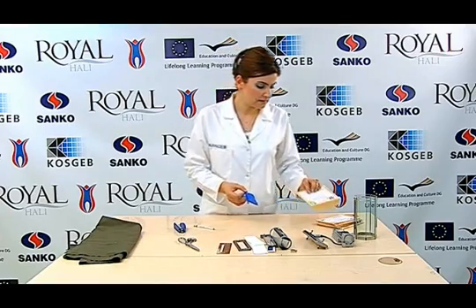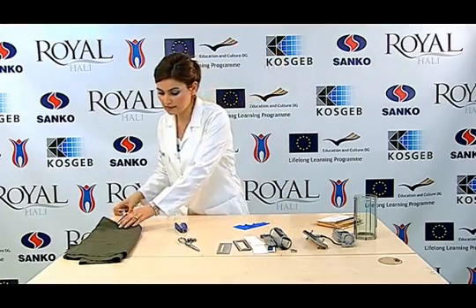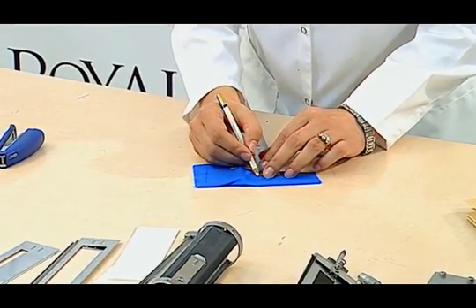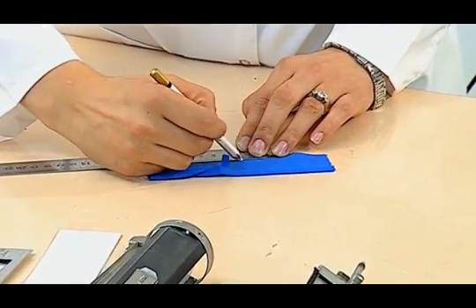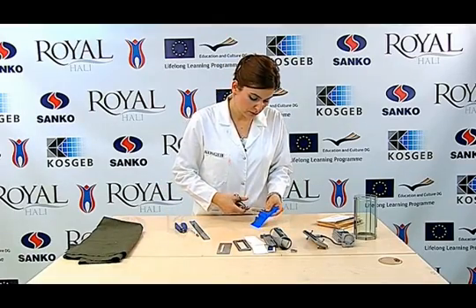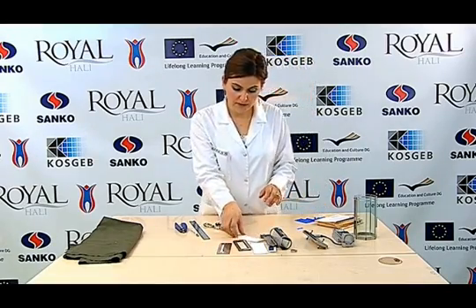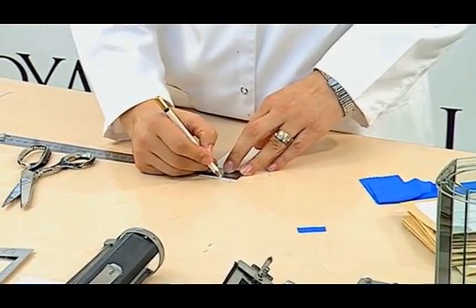There are three different methods in this standard and the second method allows us to test multiple samples. We cut the sample at 1 cm by 2.5 cm from the blue reference with a ruler, cutting along a straight line. We use the opaque cardboard again to mount the blue scale, cutting the opaque cardboard at 2.5 cm by 13 cm.